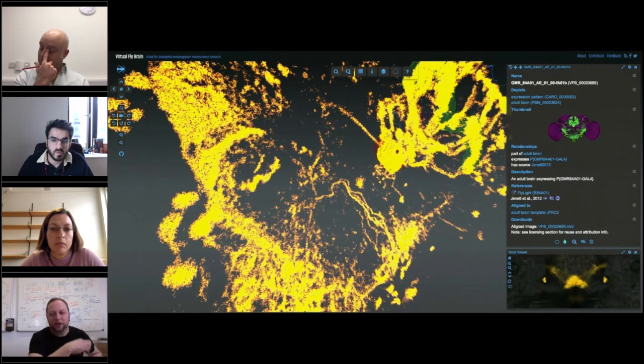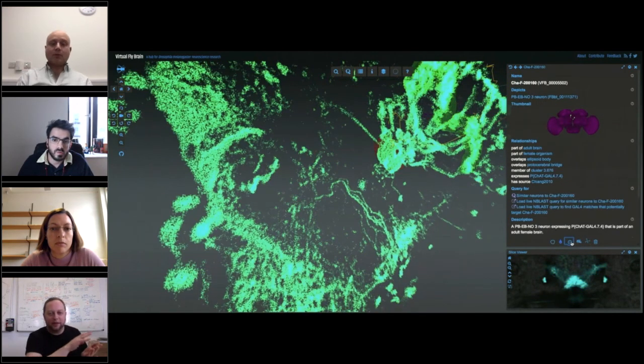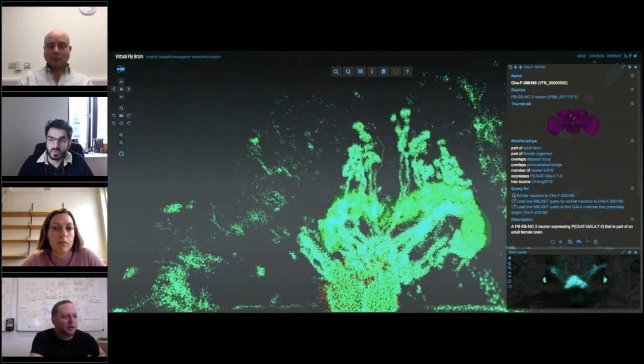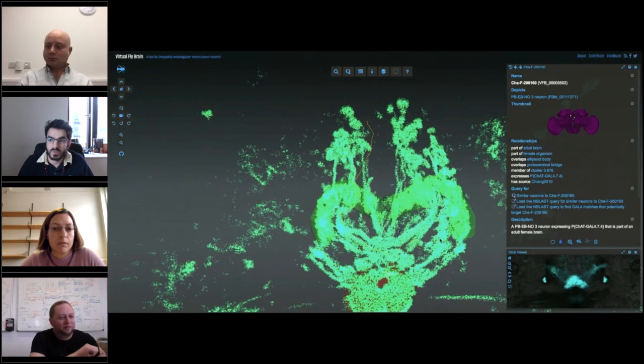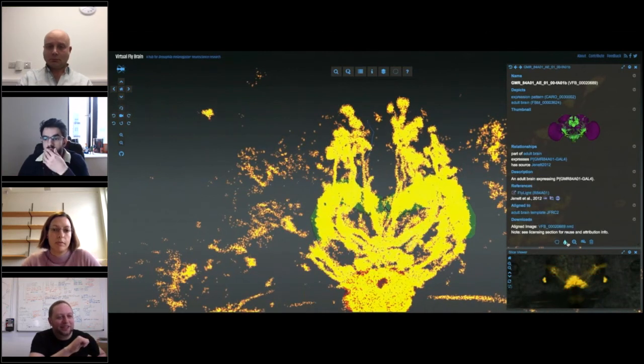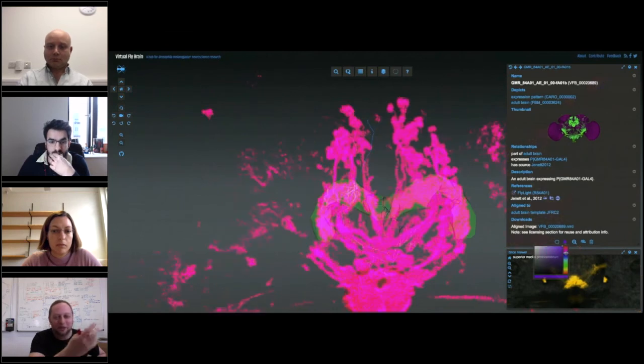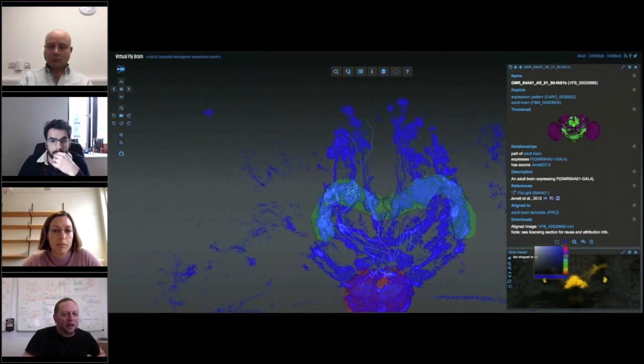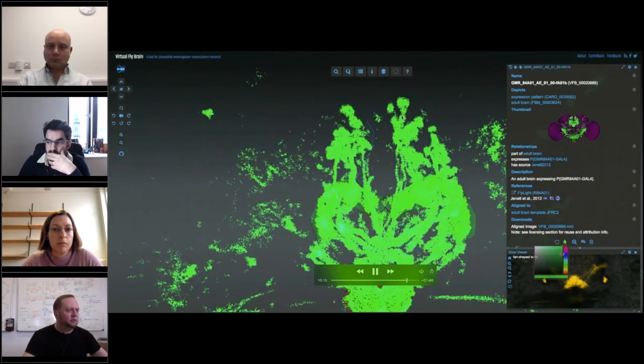You can then find multiple to put together and start developing splits, which is how most labs do this. It's also worth pointing out, as it's picked a hideous color, you can change the color and the contrast and everything to develop the image that you want. At that point, I'm going to flick over to an actual live one.